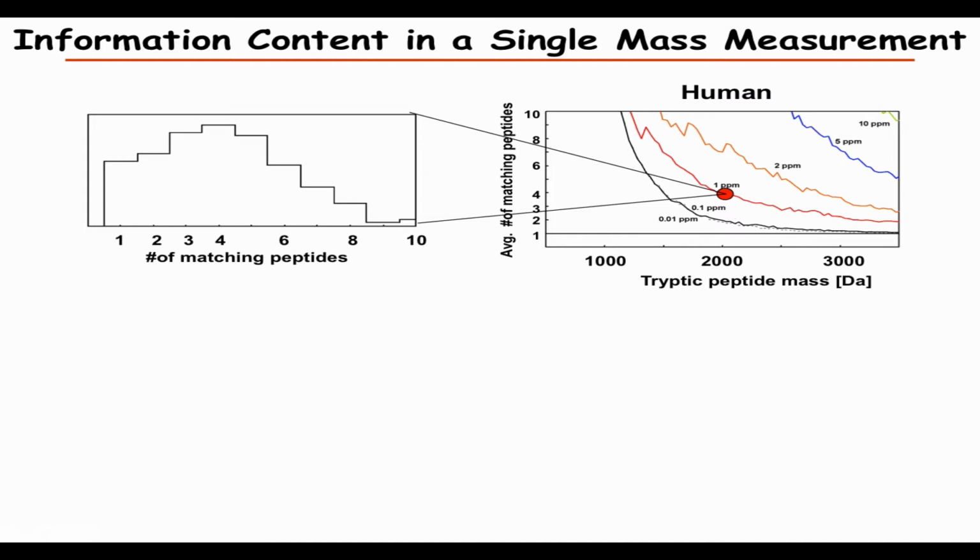What we've reached is that we can determine the elemental composition at that stage. We have such high accuracy that we can tell exactly which atoms are there, so which amino acids. The only thing we don't know is the order of them, and that we will never get from that measurement, of course.